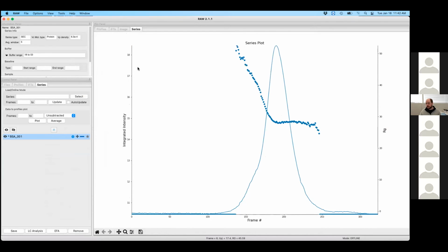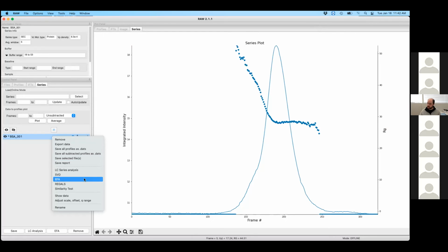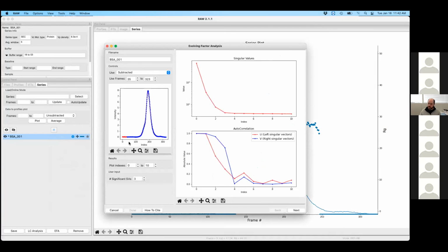But you may have a data set that's not as amenable. This one, for example, has this contaminant, so you can carry out the deconvolution. I'm not going to go through in detail how you do it, but the basic general idea: you pick the range of data that you want to deconvolve, something like that. You figure out how many components are in it using the singular value plot, and go with 2.